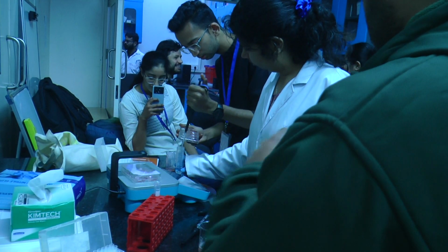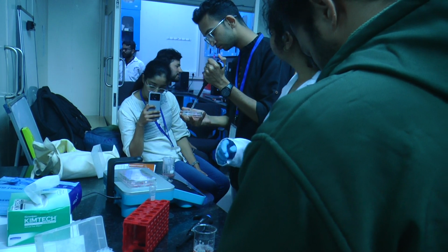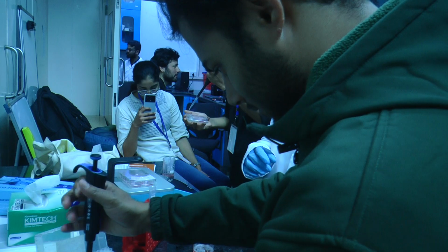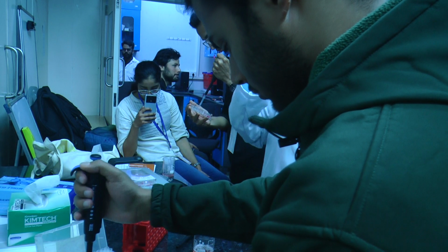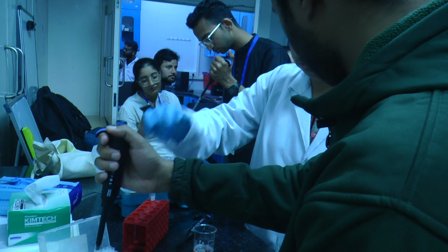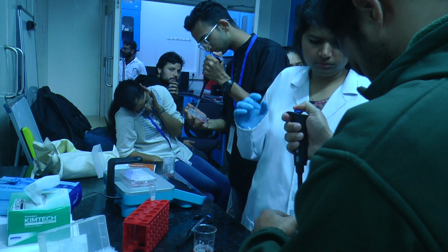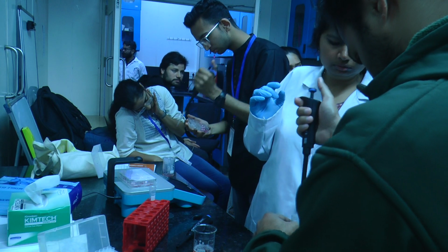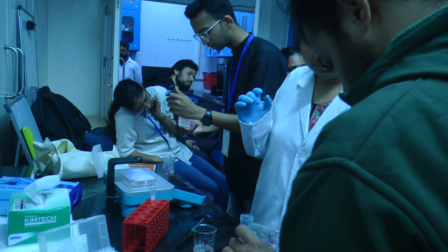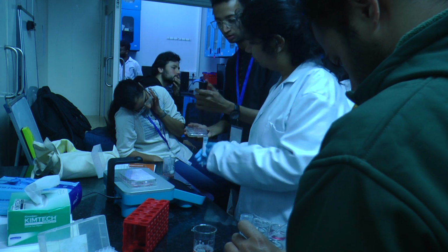That is what is difficult to achieve by adding components to get the proper type. So what I understand is that you are trying to get the real, living cell and then extract the inside one. Basically, in short, I'm extracting the plasma membrane. So it is a replica of the plasma membrane.